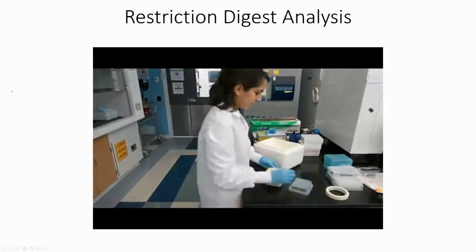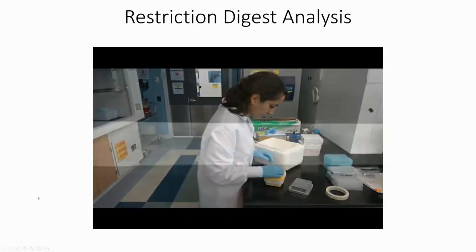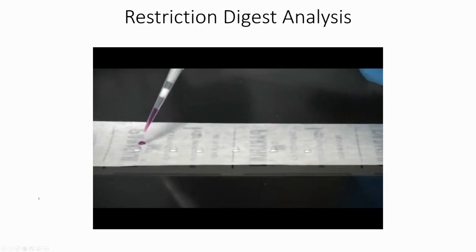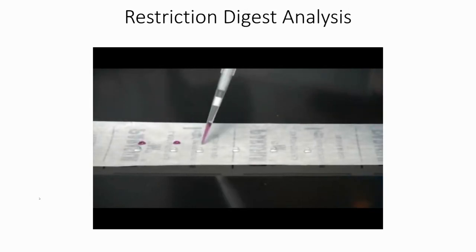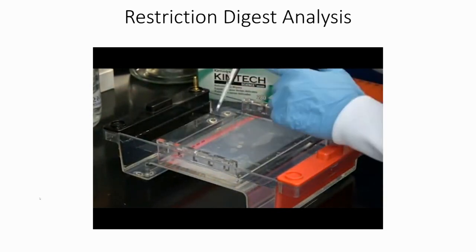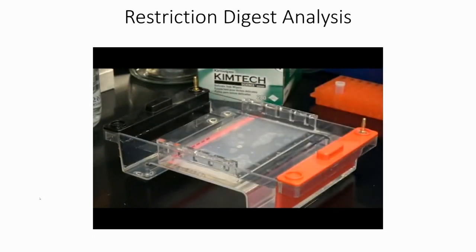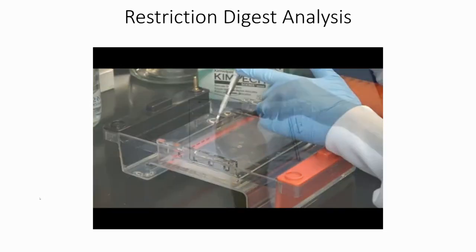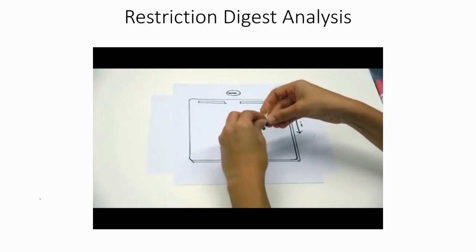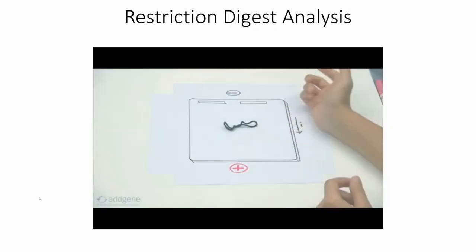Restriction enzyme digestion is a fast and inexpensive way to gather broad sequence information about plasmid DNA. A restriction digest can give a generalized, bird's eye, or macroscopic view of the entire plasmid. It can also reveal useful information, like the purity and conformation of a plasmid, which is important for downstream applications like transfection. For example, supercoiled DNA has higher transfection efficiency than nicked DNA.